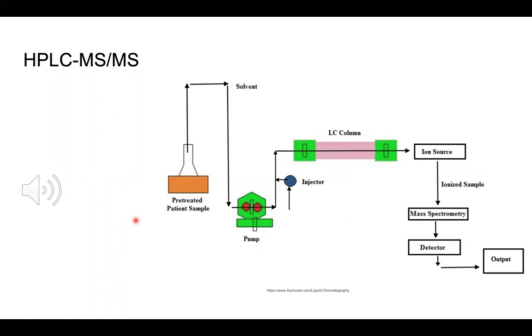So HPLC, on the other hand, can analyze these acidic compounds without the need for this extra derivatization step. And basically, a derivatization step is just an extra step to add some sort of chemical modification in order to still be able to identify that compound, even if it becomes decarboxylated. So the fact that HPLC doesn't need this is a major advantage because it allows for a more complete cannabinoid profile of the cannabis products.